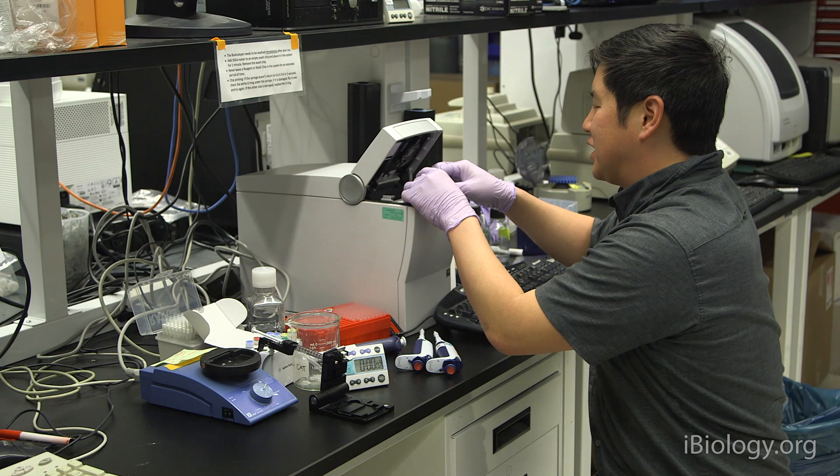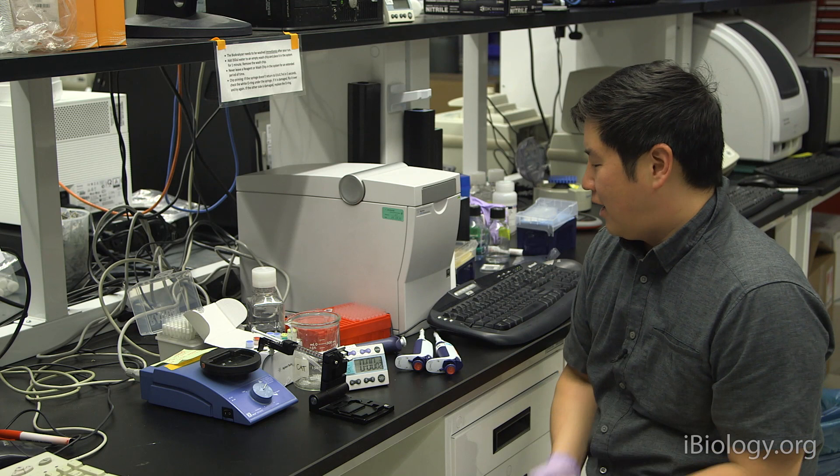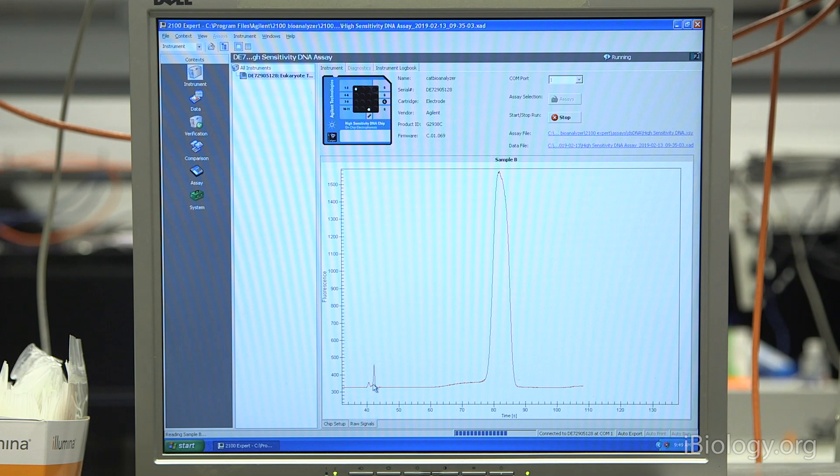Now the chip is prepared and ready to run. What we want to do is go ahead and place this into the bioanalyzer system, close the lid, and then once the system detects the chip, you'll be able to click on the Start button to begin the run. A run of a full chip will generally take about 45 minutes. It's a good idea to stick around for a few minutes until you see the ladder run, just to make sure the run has started okay before you take off.